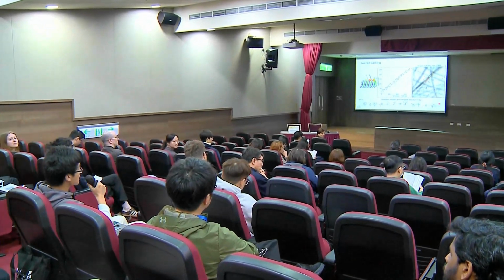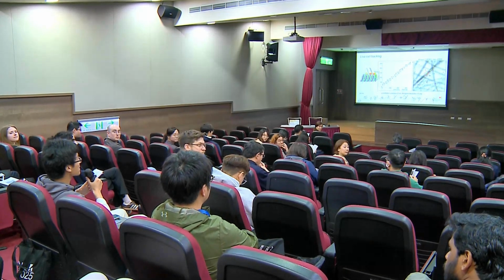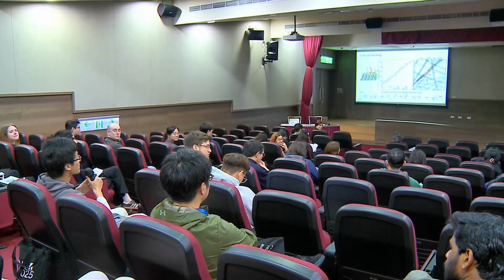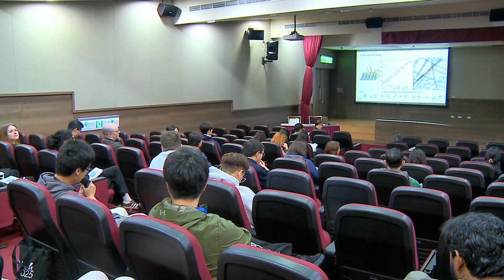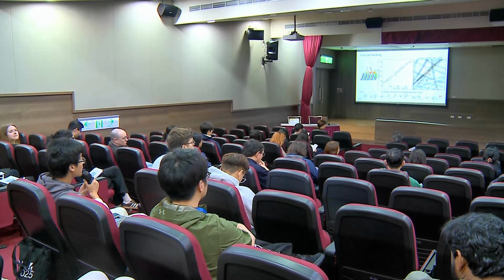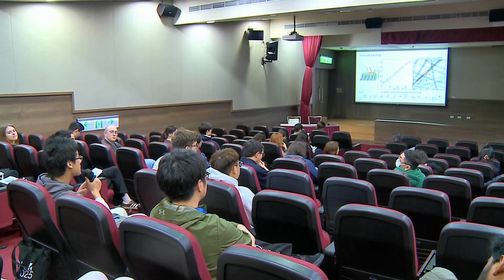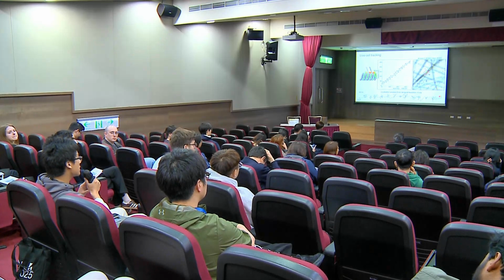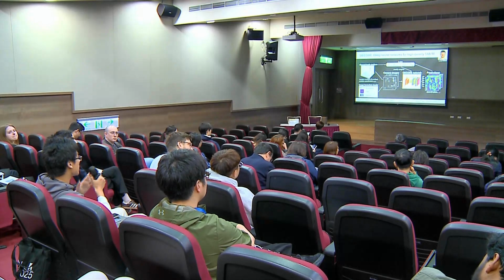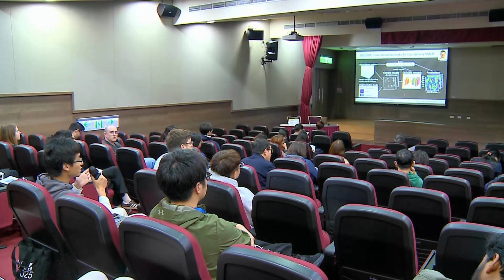Okay, thank you for your nice presentation. I'm not a single molecule localization guy, but I still learn a lot from your tutorial presentation. I have several questions. My first question is, in the introduction of the deep learning part, I think your training data is simulated. Why do you use simulated data and not measured data? Is there any difficulty in acquiring measured data for training, or did you just not do it?